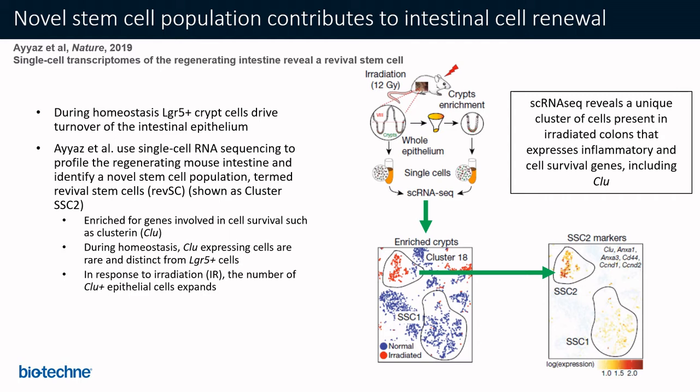response to injury. So researchers from Alex Gregorieff's lab at Mount Sinai Hospital in Toronto used single-cell RNA sequencing to profile the regenerating mouse intestine and identify a novel stem cell population termed RevSCs, or revival stem cells. And you can see them here in the cluster SSC2.